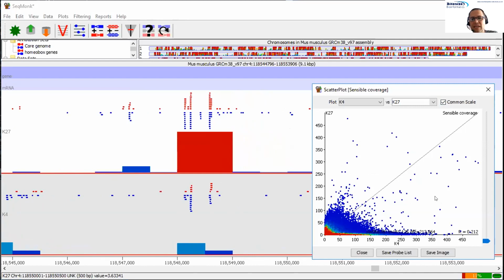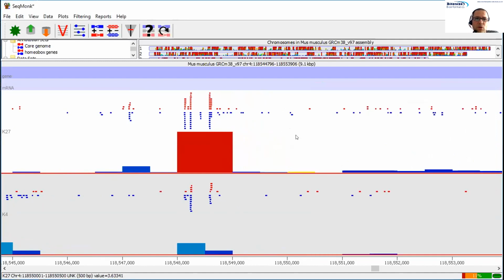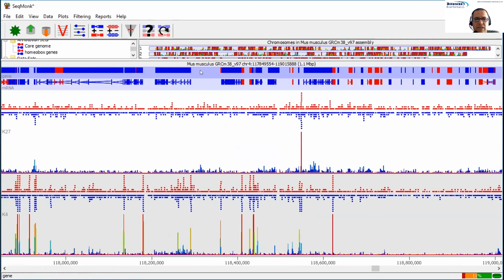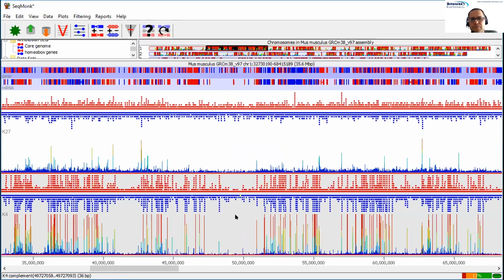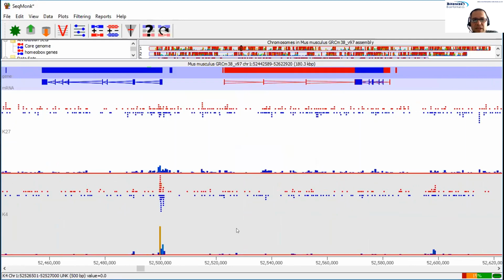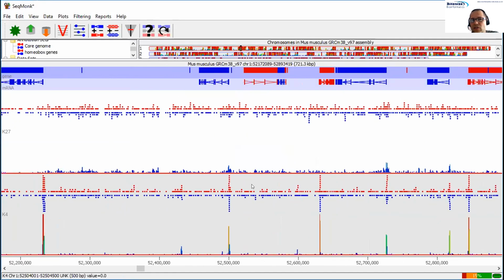So we looked at the histogram of the quantitative values and a scatter plot comparing two values. One other type of plot that you can do is a summarization plot. If we look more generally in this data, let's just pick chromosome 1 to have a look at. We can see that if we look where the peaks are, there's a suggestion that those peaks all seem to turn up around promoters.